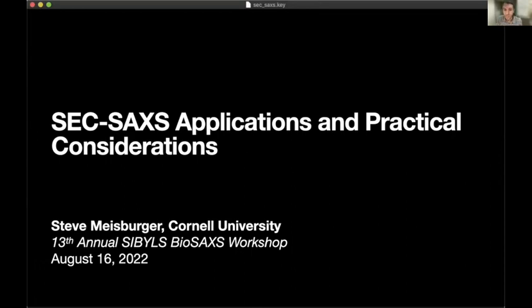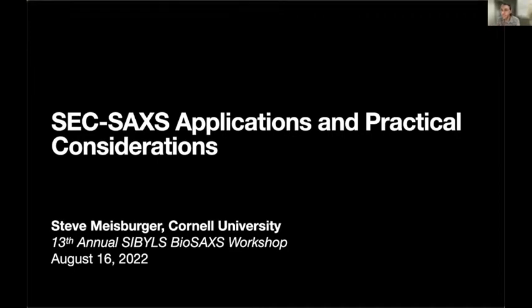So, okay, I'll tell you a bit about SEC-SAXS as a technique, and also mainly how you can analyze your data, because that actually turns out to be kind of the tricky part. And I'm going to try and do some live demos as well. We'll see how that goes.